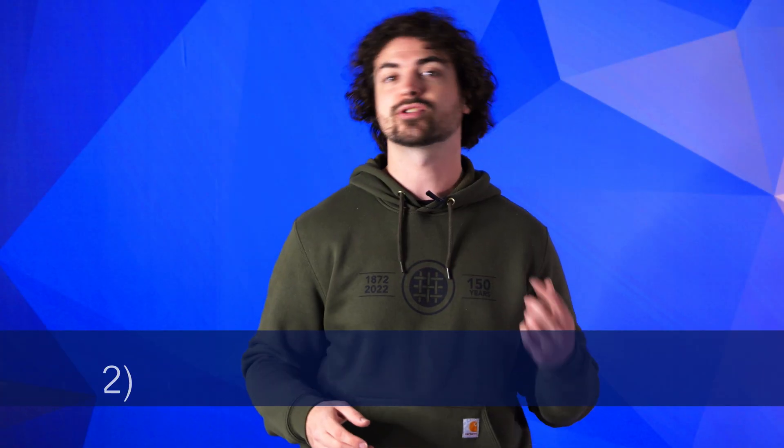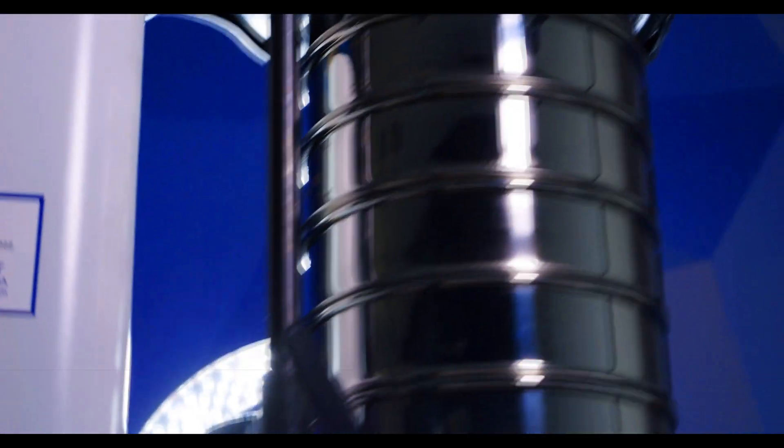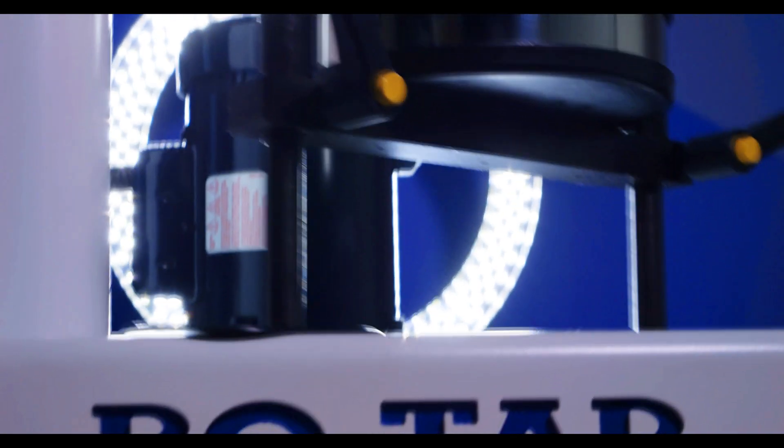Currently, the RX29 costs $2,900. This price reflects the cost of the raw materials used to construct the device and doesn't include any test sieves.